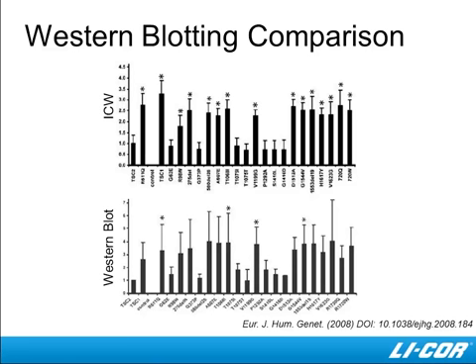With a Western blotting, you're lysing cells, spinning out insoluble material, running gels, transferring those gels. There's a lot of steps there. One, with liquid handling, where you might lose sample, change sample to sample. You might be losing protein along the way. All of these steps increase your variability from experiment to experiment.